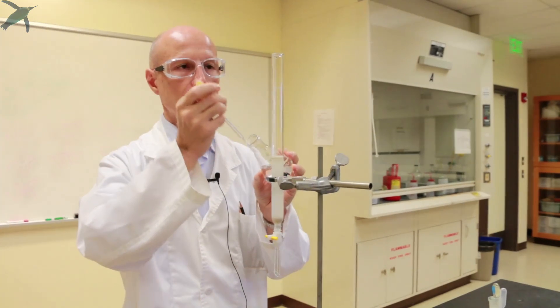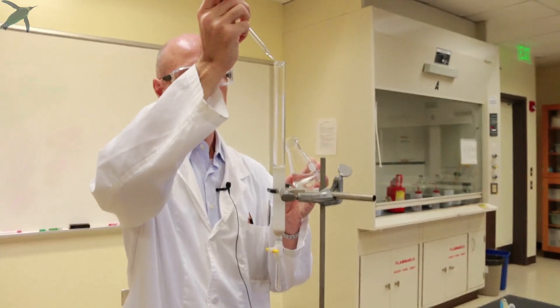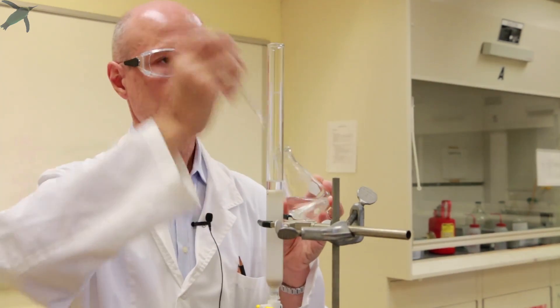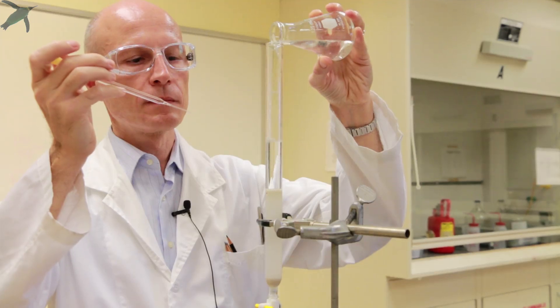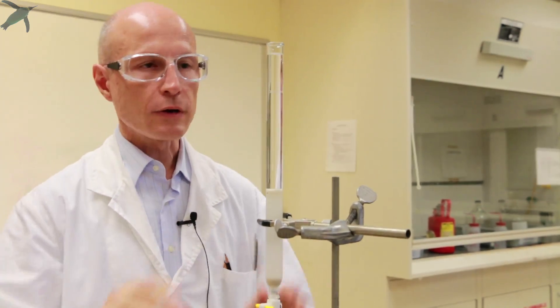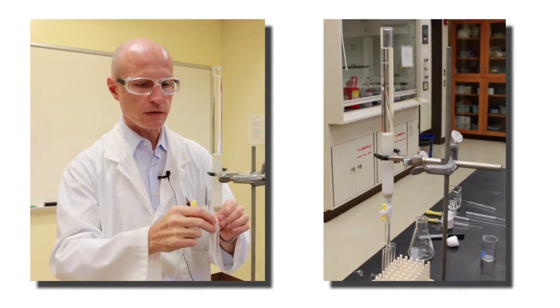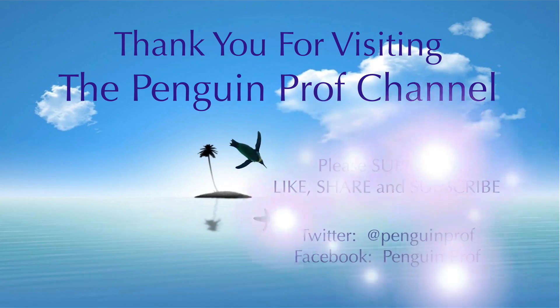So you can add your eluting solvent very slowly at the beginning, so you don't disturb the surface of the silica gel. And then more briskly until the column is full. Now you're ready to run. So you can open the stopcock and you will start collecting small fractions in test tubes. And this concludes your column chromatography video. Thank you.